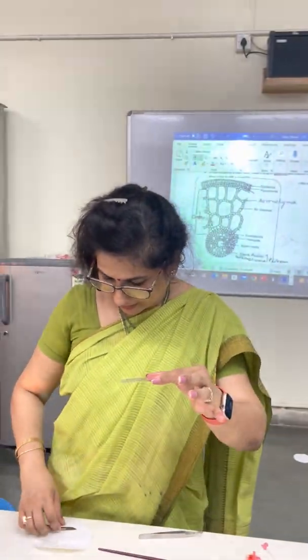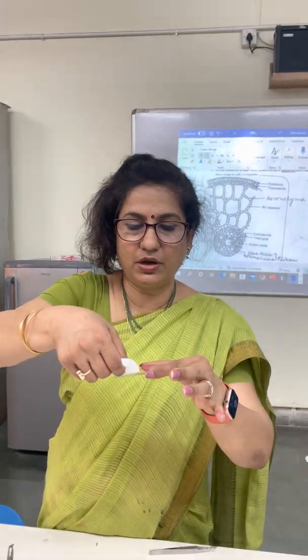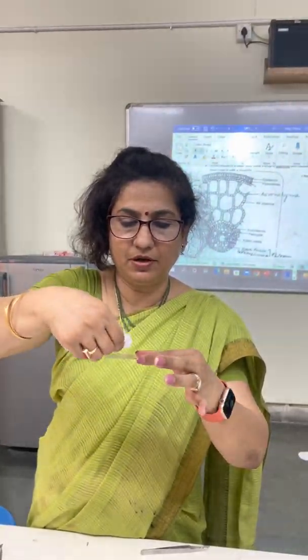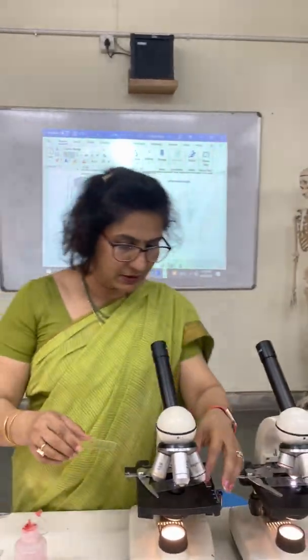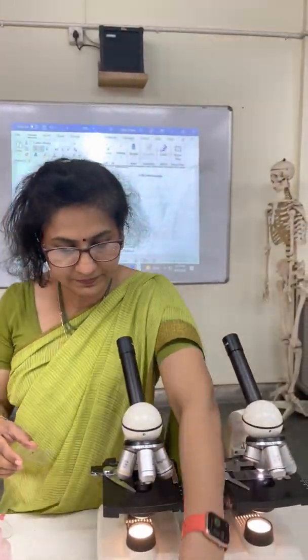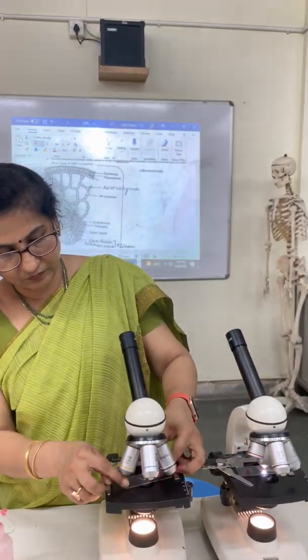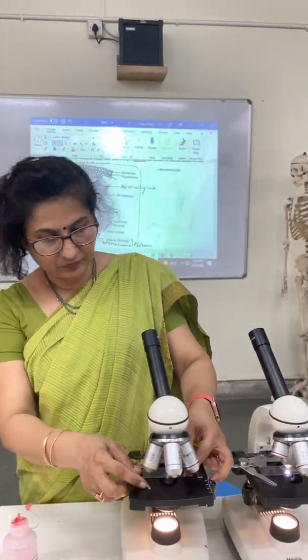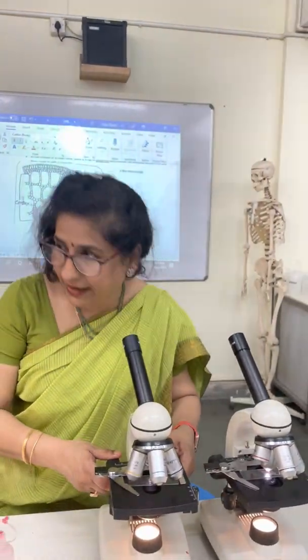Whatever extra glycerin there is, just soak it with the help of filter paper so the slide is clean. Now we focus it under the microscope and it looks like this.